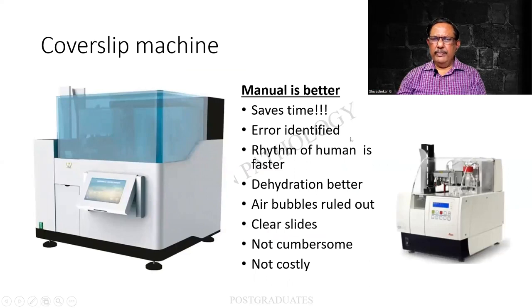So cover slip, this again is one more failure over here. I find that manual is always better because here again, they are trying to cover each and every slide. But then manual, you will be able to save time. You can find out the error. Air bubbles can be avoided. There is a precision. The hand of the technician, it speaks for itself. And also processes such as dehydration, clearing, everything is well made. It is not a cumbersome job. It is not costly when we do it manually. So I still feel, in my personal opinion, manual, as far as the cover slip is concerned, is much better.